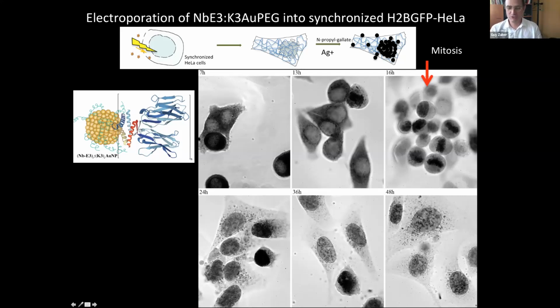In our case, when we want to label things inside the nucleus, usually what will happen is, if we have a transcription factor that is synthesized inside the cytosol, the antibody will bind to it, and maybe the transcription factor will get in.